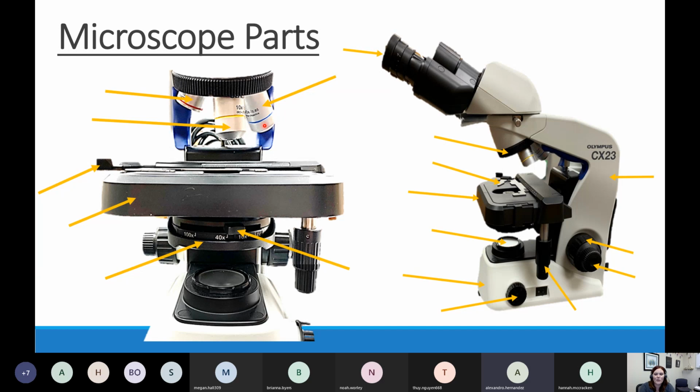When we're looking at a tissue like bone, for example, bone tissue, we can probably just do the low power objective. There's not going to be a lot of slides that we use the scanning objective for by itself. Most of them have to go up higher. But the scanning objective is where we always start when we're looking at specimens.